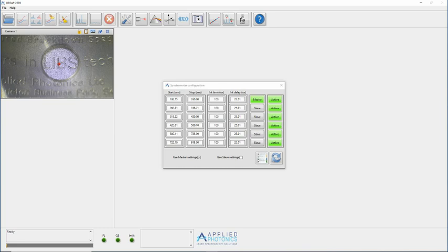The wavelength range of each channel is also factory set, so that the overall range of the spectrometer module is continuous without any wavelength gaps or overlaps between channels. The wavelength range of a channel can be adjusted within the set limits for that channel, but there should be no need to do so.